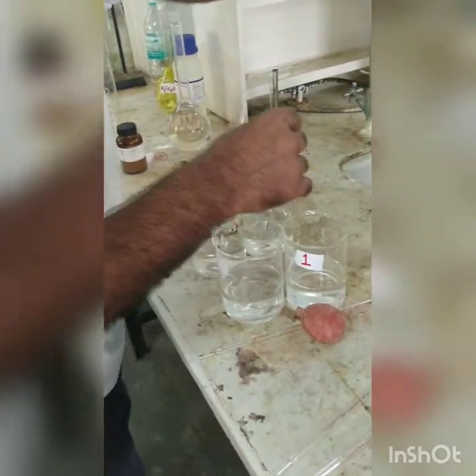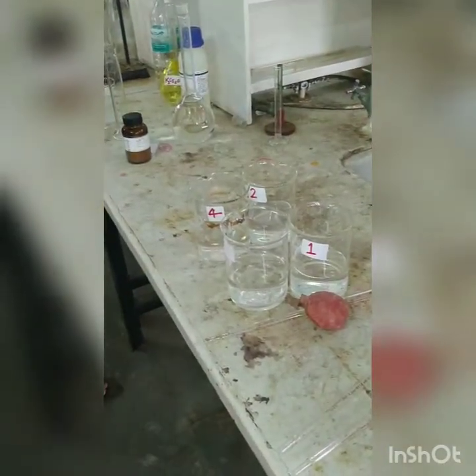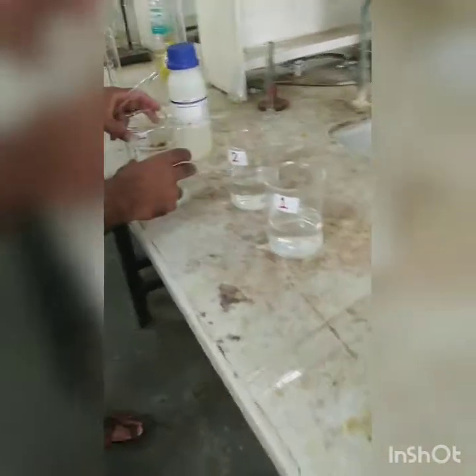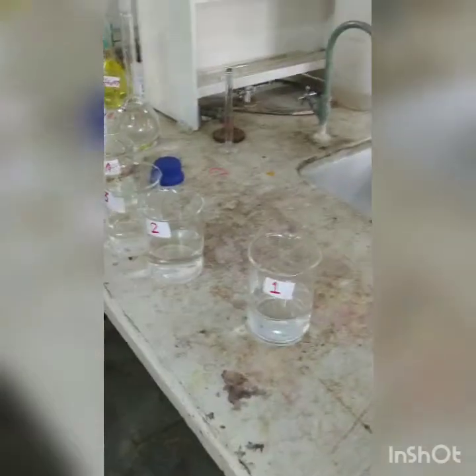Yeah. Now to these 4 beakers, to each beaker add 1 ml of acetic acid. So we are going to add 1 ml of acetic acid in each of the beakers and a few crystals of potassium iodide, KI. Earlier it was mentioned 2 gram. Now we have to add a few crystals. So there is no need to weigh it. By judgment, about a spatula or so will suffice.